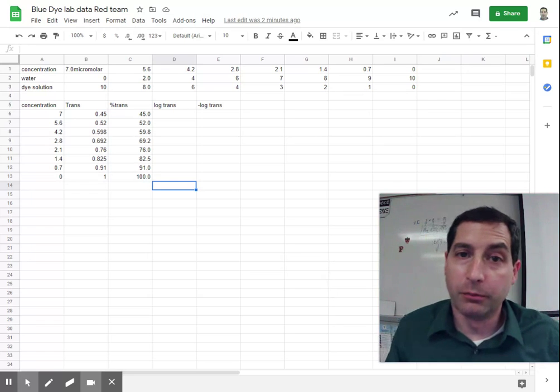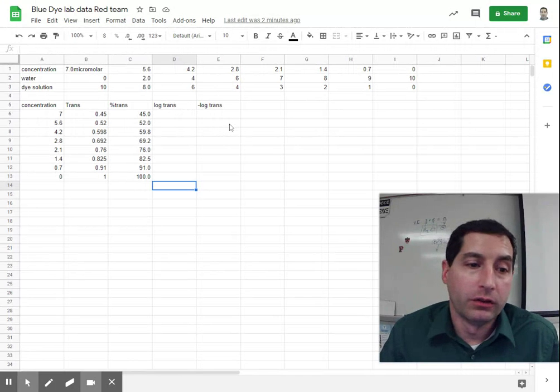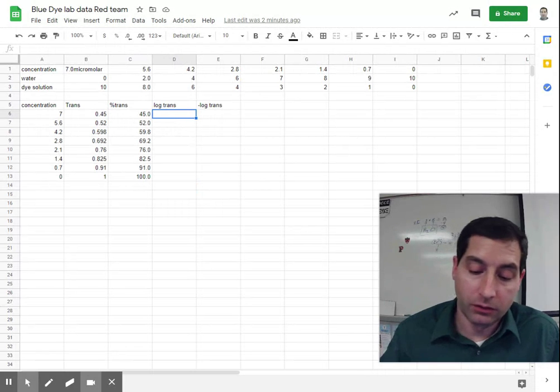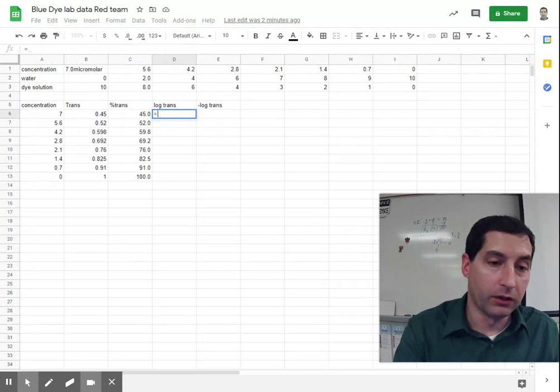This video is a reminder about how to do the graphing for the Beer's Law Lab. So if you take a look at the data we have here, remember you can use an equation to calculate your log of transmittance. Log is just a mathematical operation. You put an equal sign to begin your calculation.